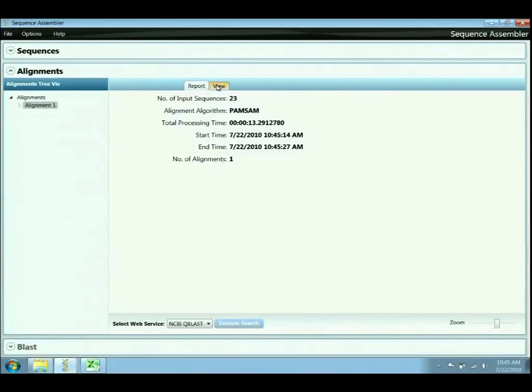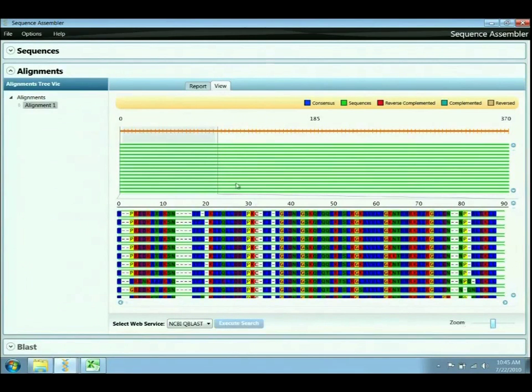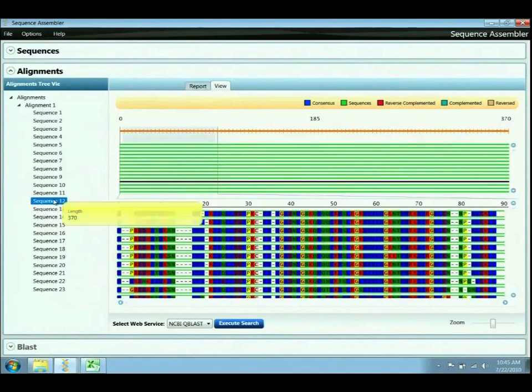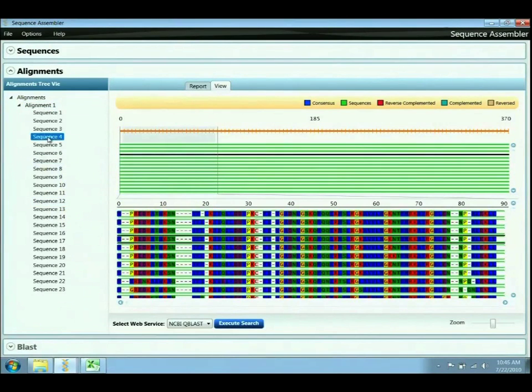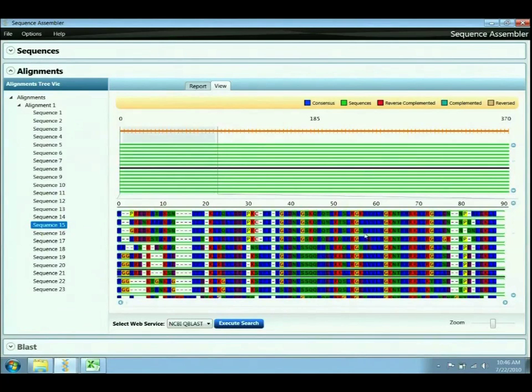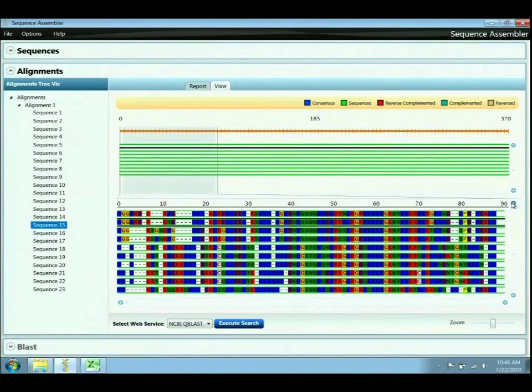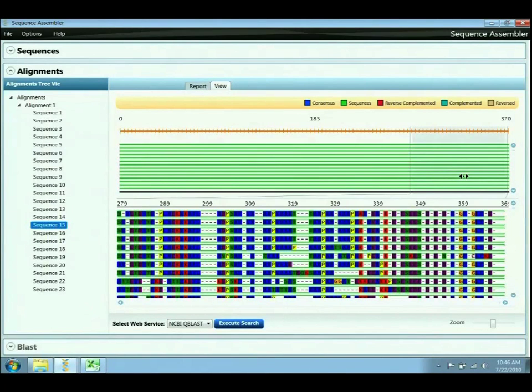And if I go back to my alignment view, we can see how all these sequences align very nicely. I can zoom out and also expand the different sequences and query them and highlight them in the right-hand view to drill in further as to what I'm looking at. And I can also scroll up and down, and the two views, top and bottom, both stay synchronized in terms of what I'm looking at. And it becomes fairly obvious in the bottom view some of the mutations or differences that have occurred in this alignment, but nonetheless the algorithm and the input parameters that define the proximity requirements for alignment have succeeded in finding a relatively good alignment for these sequences across the spectrum of the sequence length as input.